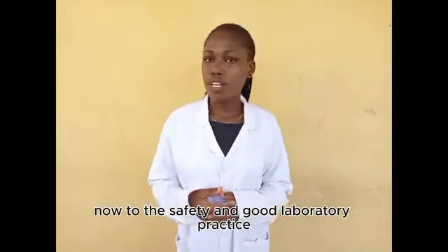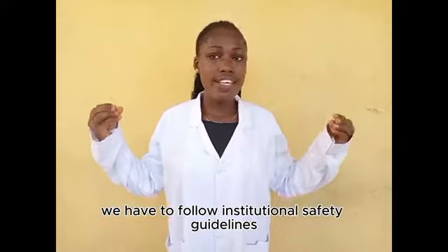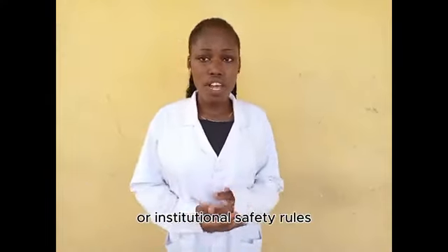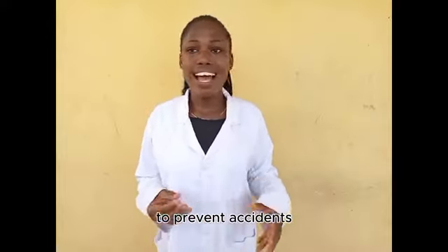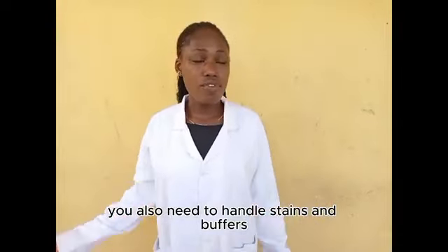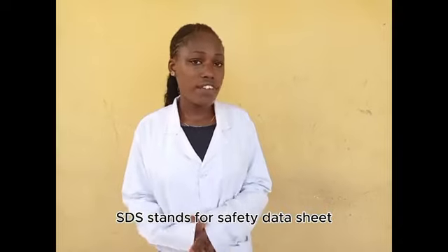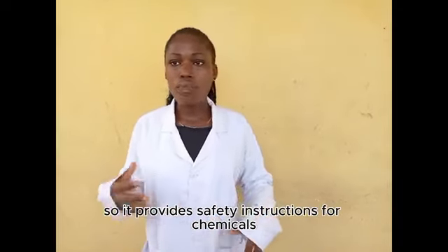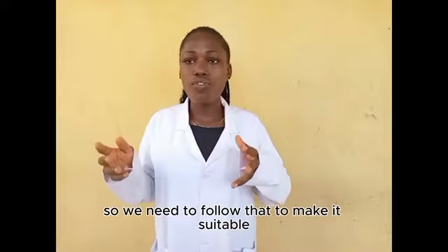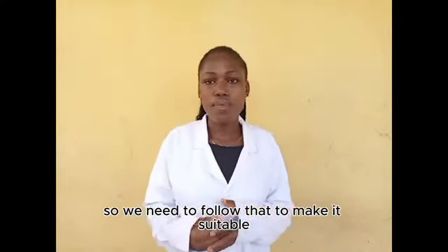Now, for safety and good laboratory practice, we have to follow the institutional safety guidelines. That is, we always adhere to our lab or institutional safety rules to prevent accidents and ensure a safe working environment. We also need to handle stains and buffers according to the SDS. SDS stands for safety data sheet. It provides safety instructions for chemicals, so we need to follow that.